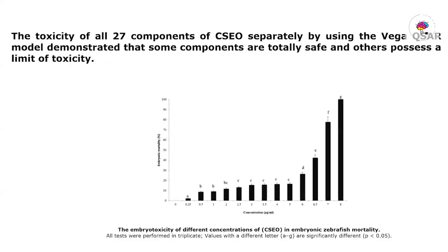The study of the toxicity of all compounds of the essential oil separately shows that some compounds are totally safe and others have limit toxicity.